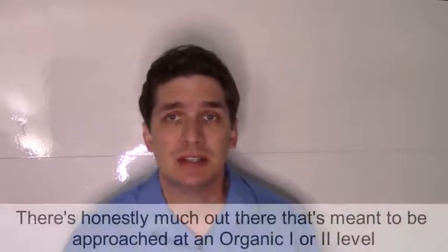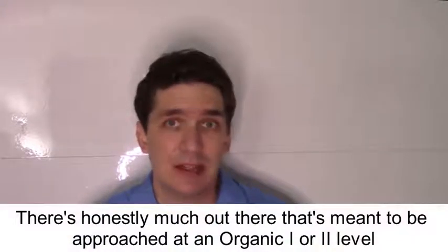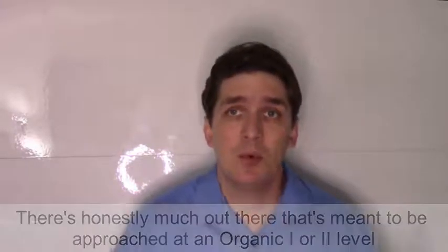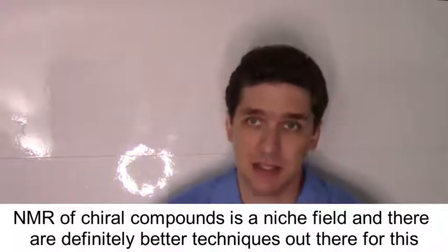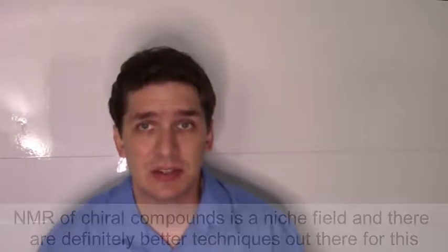It's been kind of fascinating to me to go through and try to figure this out, because there are lots of chiral compounds, particularly when you start getting to rings. You'd expect there to be chiral compounds because it's just so easy to generate chirality on a ring. But why do textbooks and resources seem to be so scant on information on NMR of chiral compounds? The short answer, I think, is that it's kind of a niche field and it's super hard to work with. So we have better techniques for determining chirality than using NMR. Why take this expensive technique and develop an analysis around it when we already have techniques that can solve it?